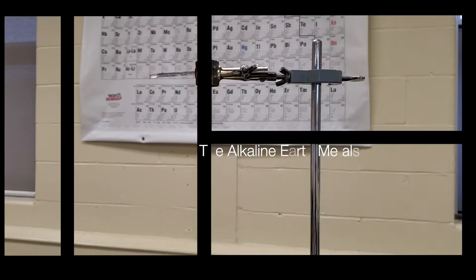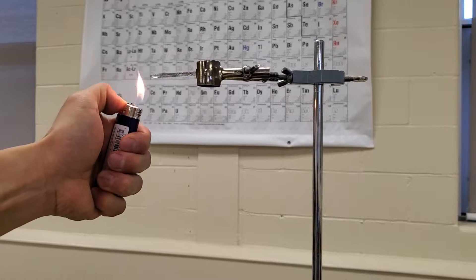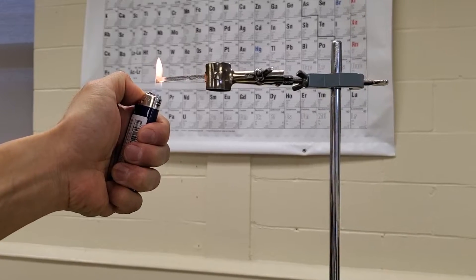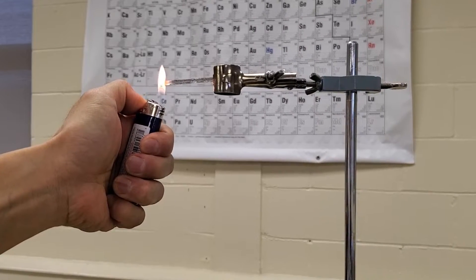This is Make Easy, the alkaline earth metals. That's a strip of magnesium. We'll take a closer look later and now I'll show you how it reacts with oxygen by burning it in air.